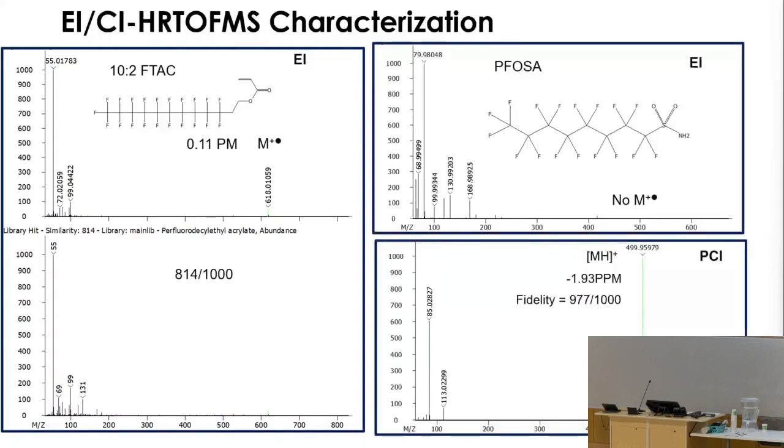In some cases, you don't have, oh, there it is, popped up. In the right case, you don't have a molecular ion. Again, skinny spectrum, that's not a problem because my standard mode of operation is EI, and then I automatically acquire CI, both positive and negative, because I'm usually in what I call discovery mode.